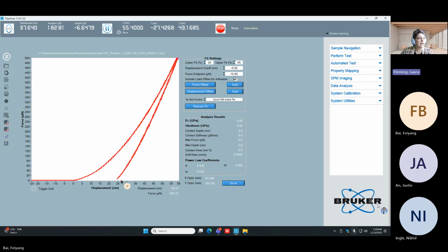The stiffness, yes, because the stiffness is the first derivative of that fit. And that fit also includes the fact that it's calculated at the peak displacement. So if your peak displacement is incorrect, I could see that also causing issues. Yes. So I would still argue that yes, the ReZero will definitely impact this. Okay, thank you.